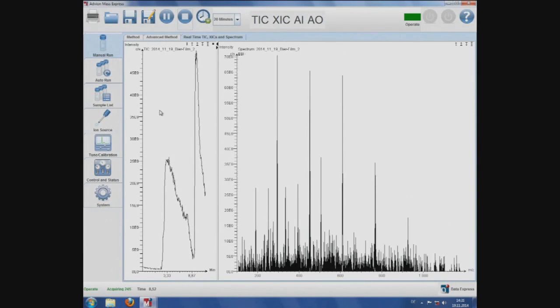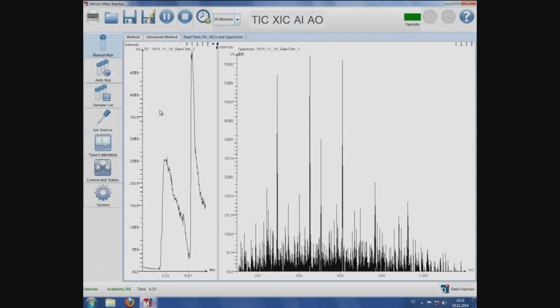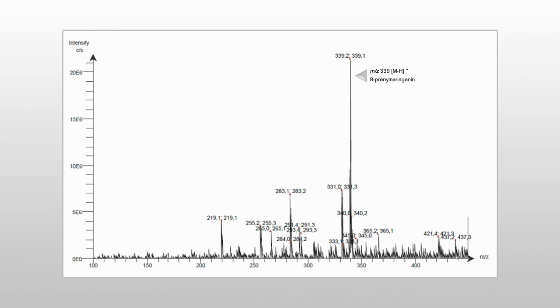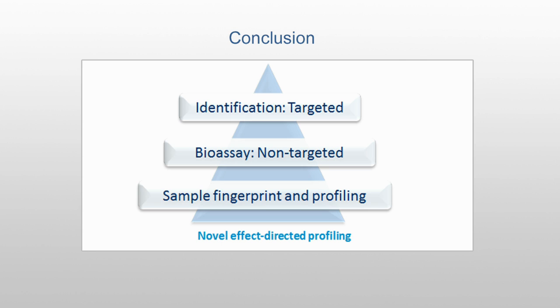The respective mass spectrum of the estrogen-effective zone was extracted. The respective mass signals were clearly visible at mass over charge for the deprotonated molecule. The imprint of the oval elution head was visible after the elution.